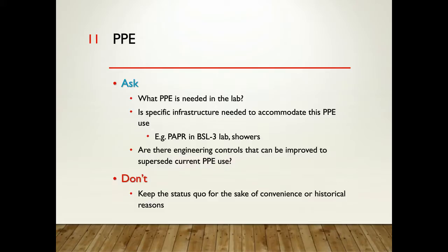Do you need a shower? Do you need a shower out of the facility? At our Vet Diagnostic Center, that's something that our necropsy lab needs is shower facilities. The same with the Biosafety Level 3 lab. That's a component of that, is that we need to have that capability to shower out should it be required by procedure or containment guidelines.